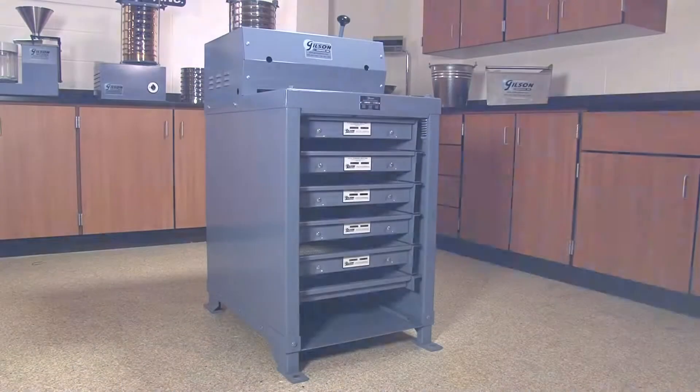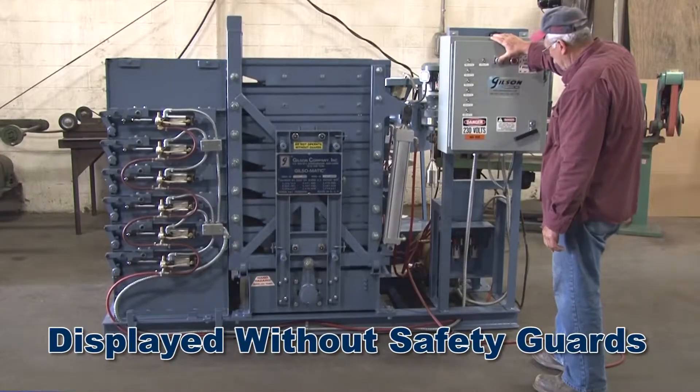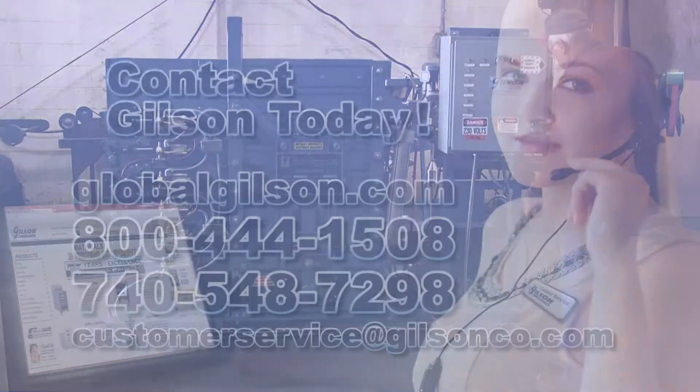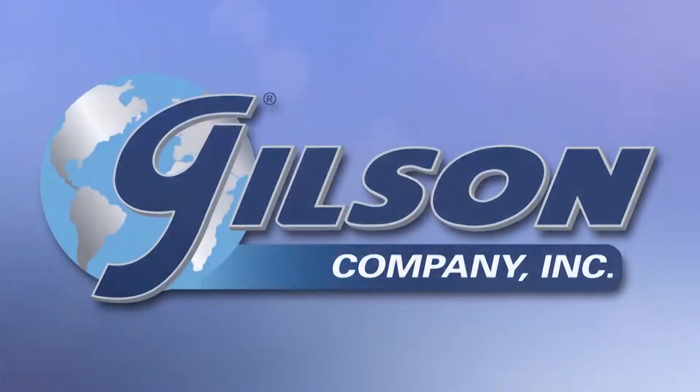From the industry gold standard Gilsom GXA 131 testing screen to the fully automated in-plant Gilsomatic Screening Assembly, Gilsom GXA has the right equipment to fit your particle sizing application. Be sure to check out these and all our other screening products in the Gilsom Catalog and on the Gilsom website. Gilsom — your industry leader in material testing equipment.